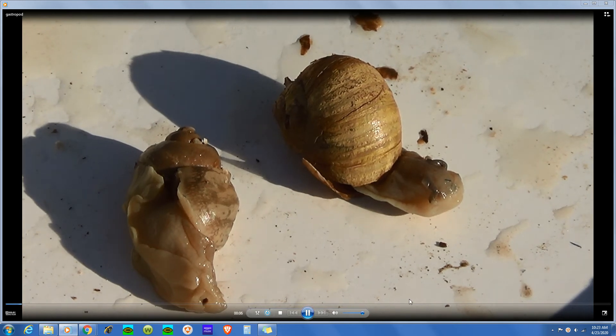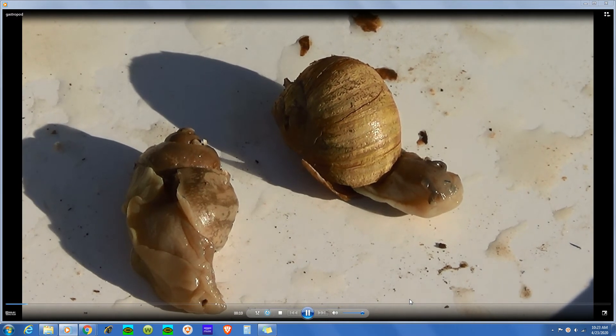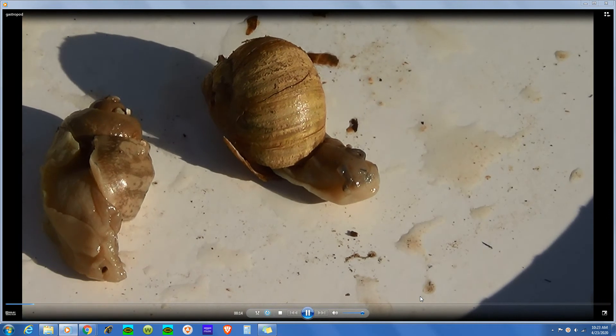Here I have two gastropods, class Gastropoda. They're snails — land snails — which you might call a pulmonate land snail.